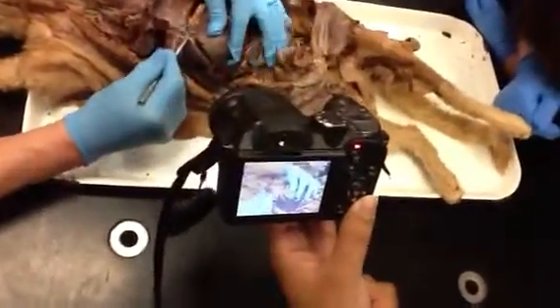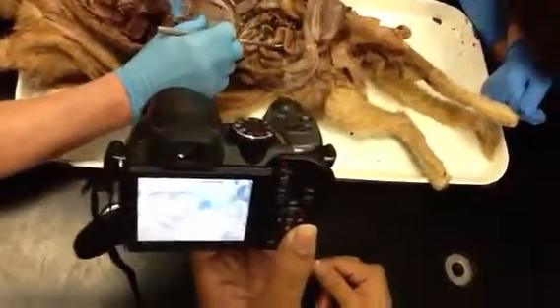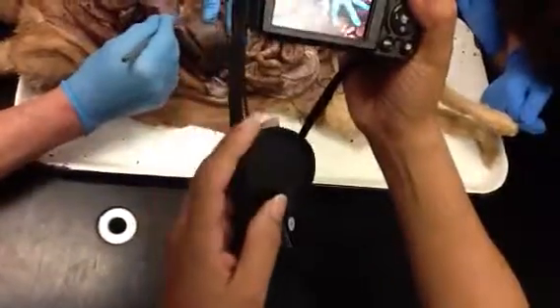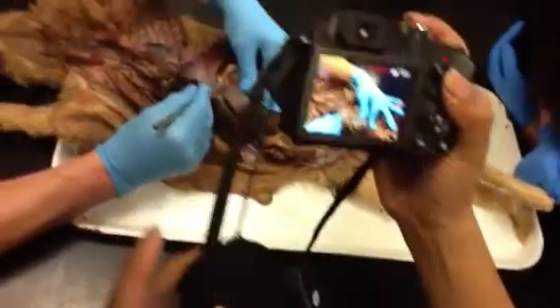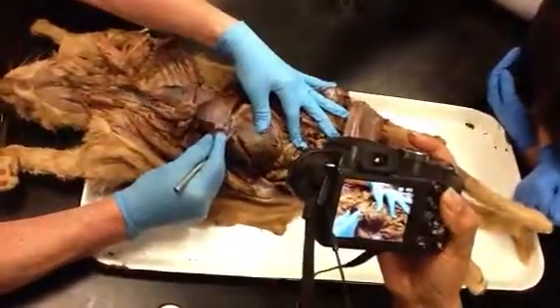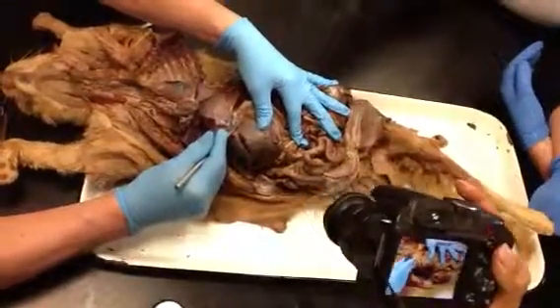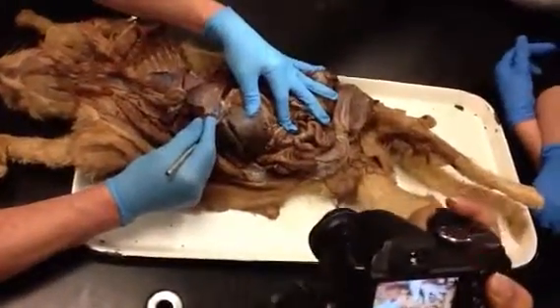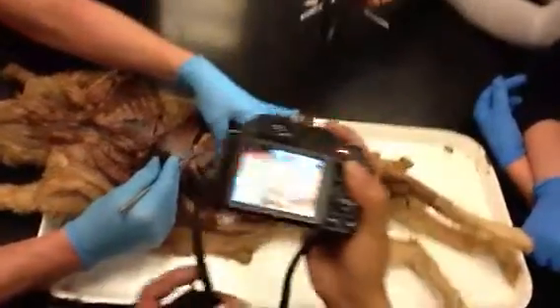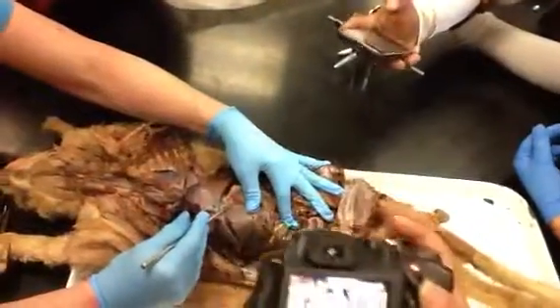I've taken a chunk off the superior surface of the liver, and I don't really have a very good hepatic. I'll make sure that I get it. Oh, there it is, right there. Okay, this is your hepatic vein. Can everybody see that well enough? What is it? Hepatic vein. Right there.